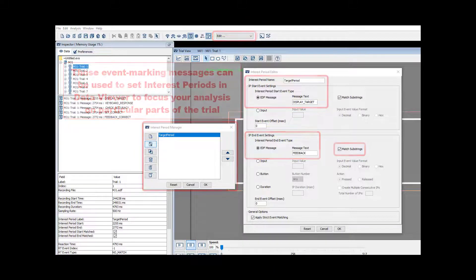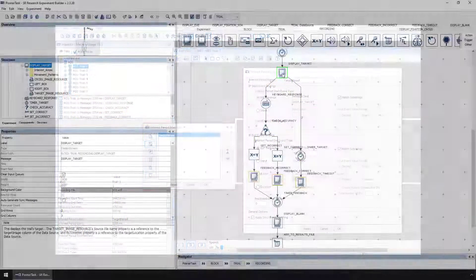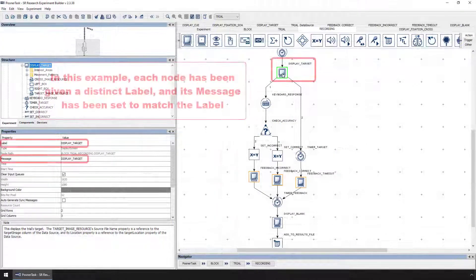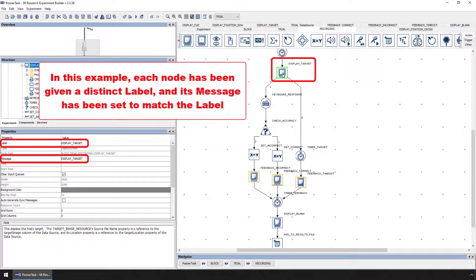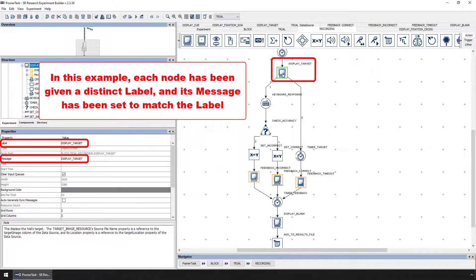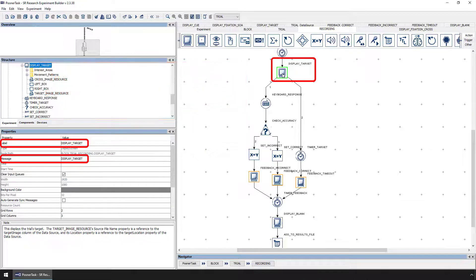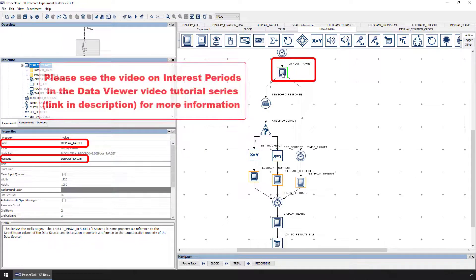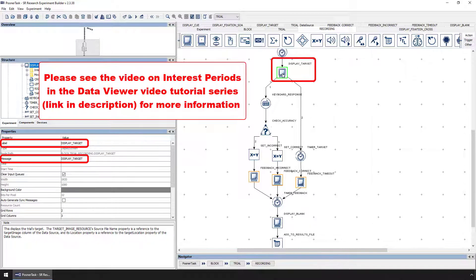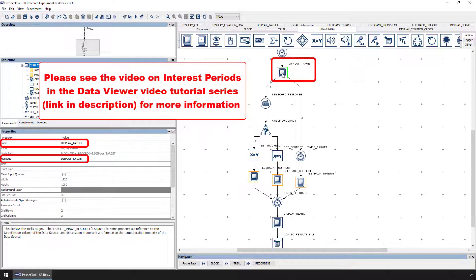In this example, we've given each node a distinct label and then simply copied and pasted that label to the message property. You can see the video on interest periods in the Data Viewer video tutorial series for information on how to use these event marking messages to focus analysis on only a certain period of the trial.